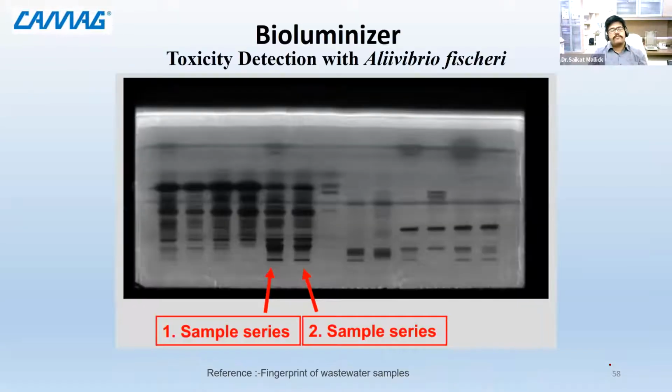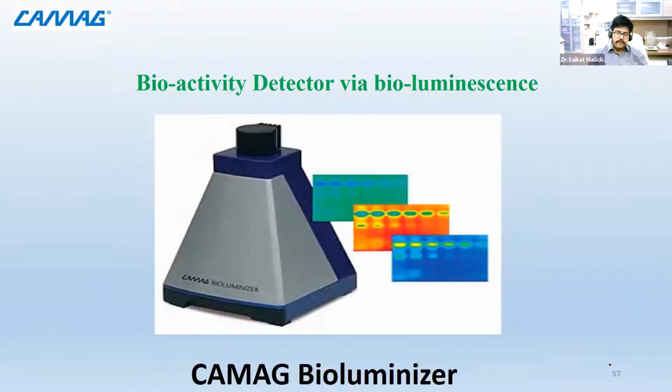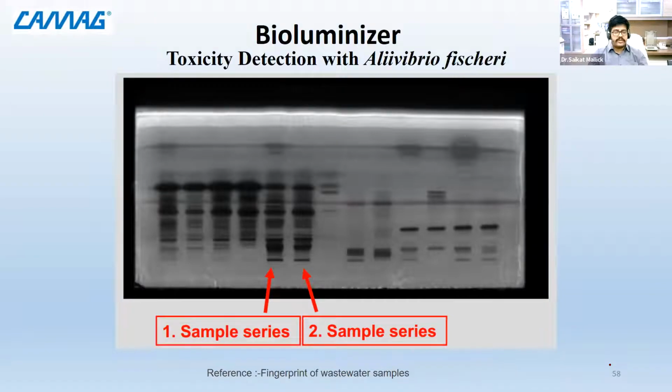toxicity. So this is the first experiment. You require this bioluminizer for this experiment. It is an image capturing device exclusively designed to capture light of very low output. So normally, if you know the phenomenon of bioluminescence, it is a very faint phenomenon.